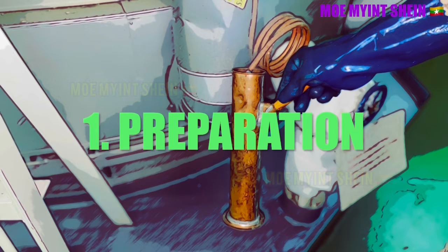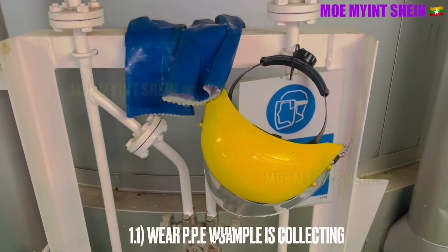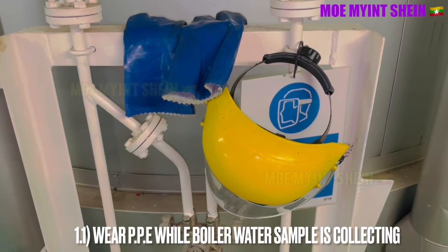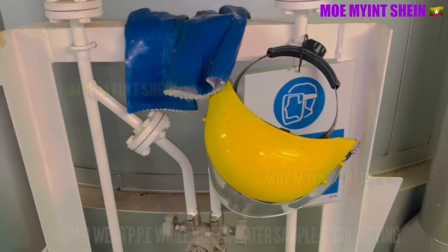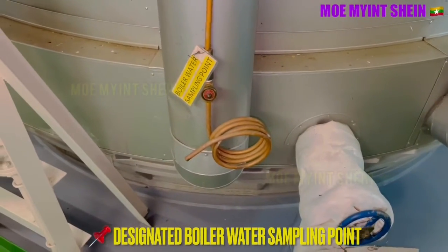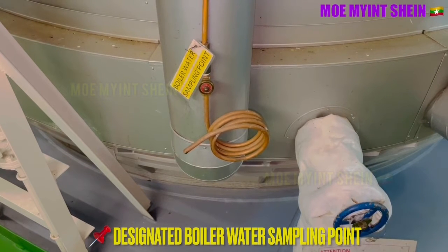Firstly, we need to take a boiler water sample for analysis. We need to wear personal protective equipment for collecting the boiler water sample. We will collect the sample water from the sampling cock.